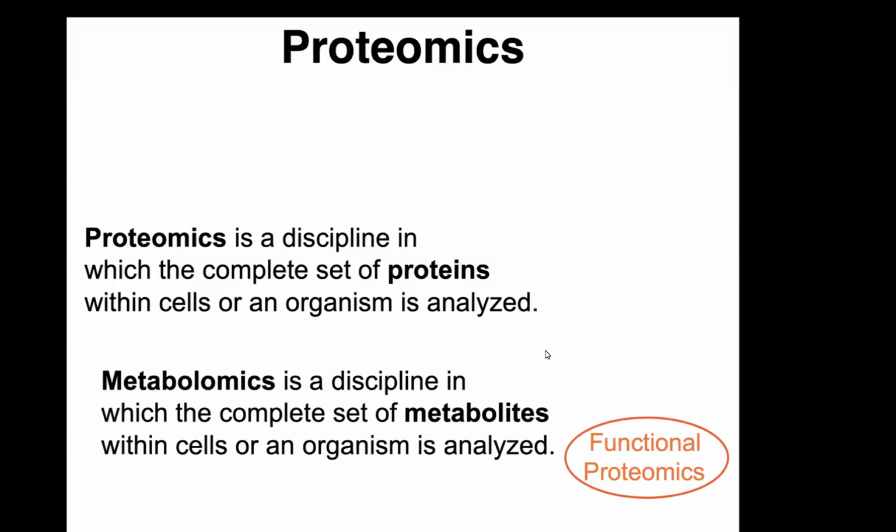So they're very much intertwined with each other, and the technologies are also very intertwined with each other. As you'll see today, much of the mass spectrometry technologies that we're using are very similar, if not identical, except for how we ultimately analyze the data that's being generated.